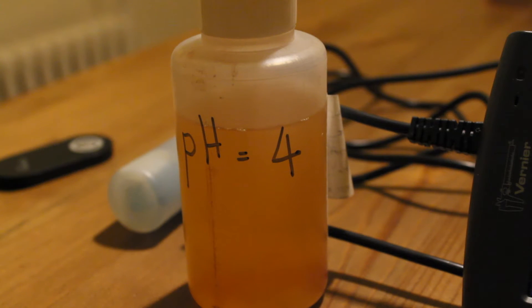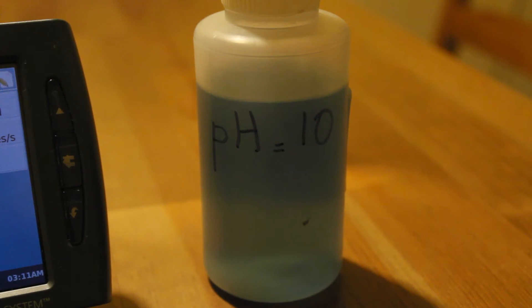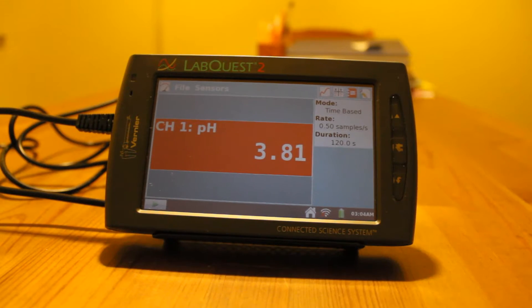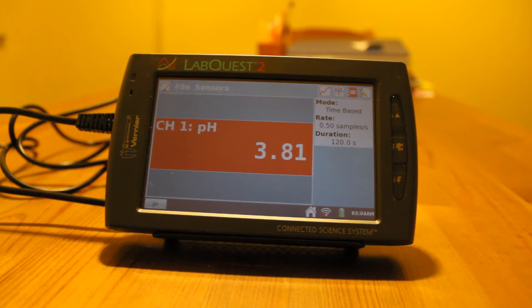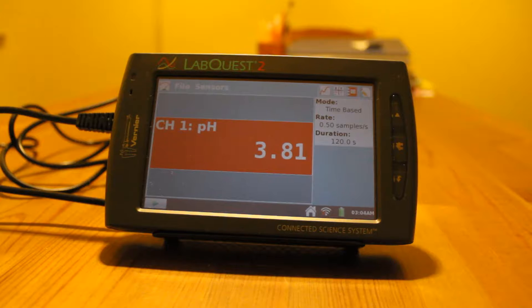You will need two buffer solutions of pH 4 and 10, as we are going to perform a two-point calibration. Buffer solutions are prepared using the buffer tablets which can be purchased from Merlin or Boreal.